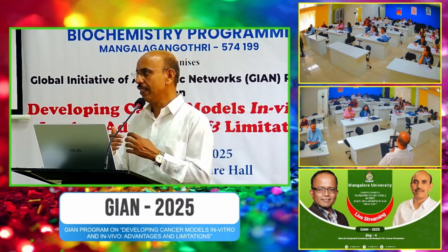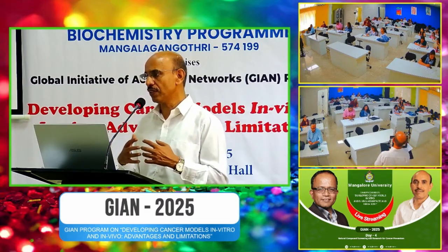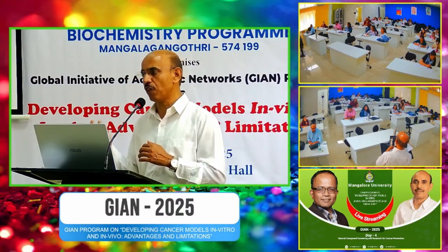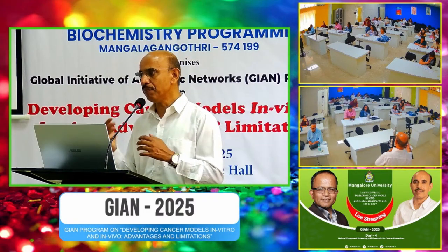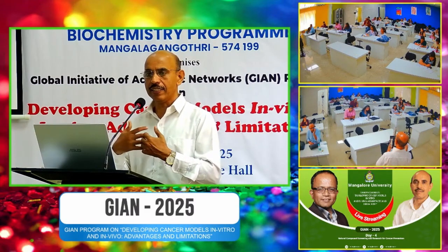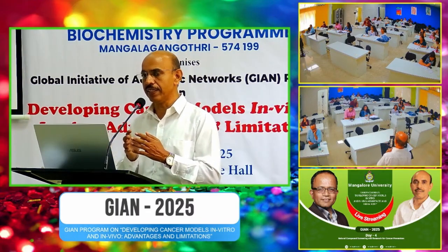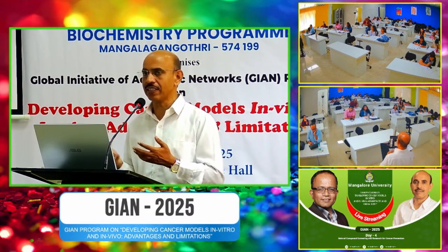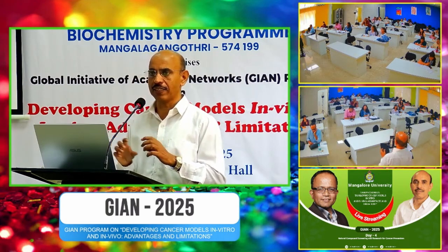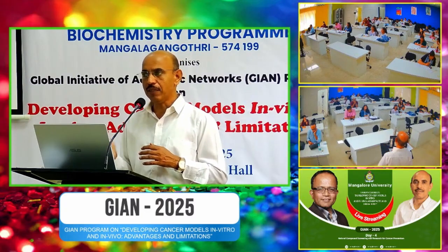And at the same time, whenever you are using the carbon dioxide incubator, usually you fix the carbon dioxide at around 5%, and the carbon dioxide present in the chamber diffuses into the media, and it may interact with the media to form reactions. Those who have studied biology know, it becomes carbonic acid, and it becomes bicarbonate and H plus. So it will help in the proper maintenance of the medium.